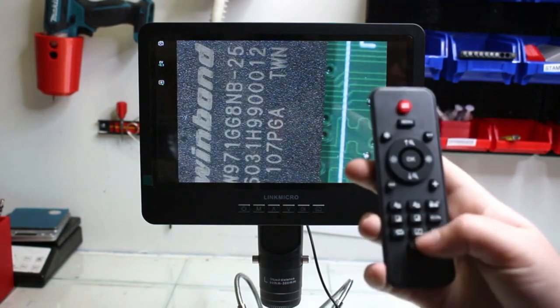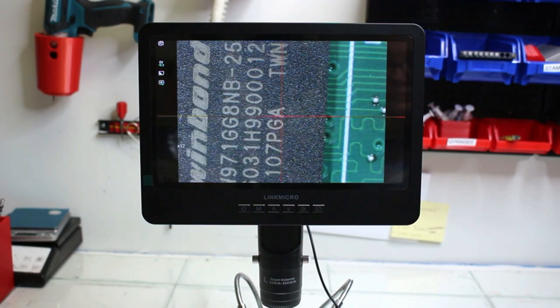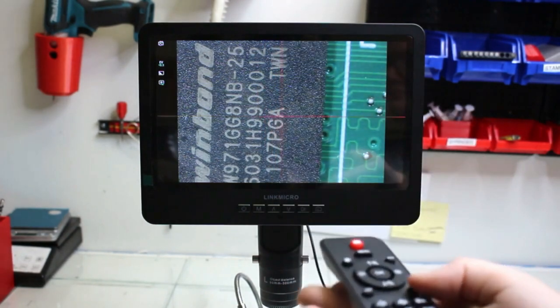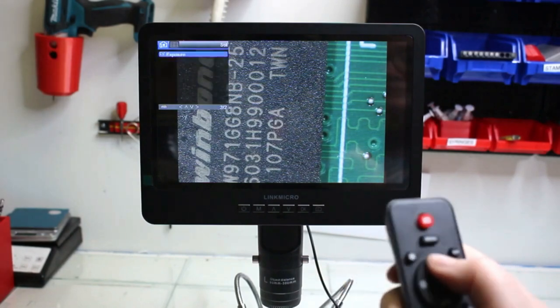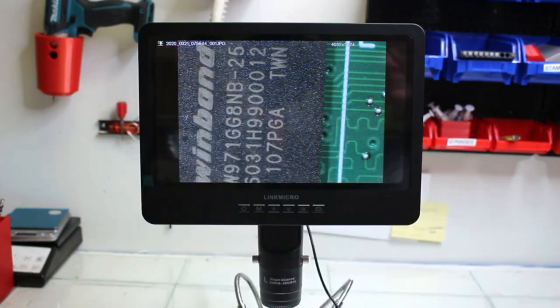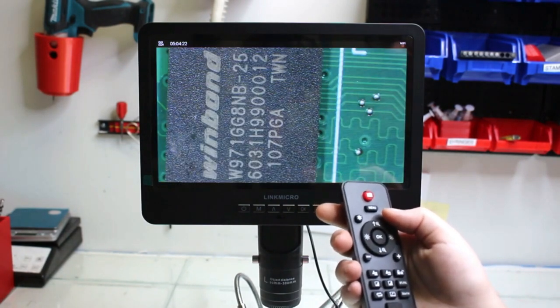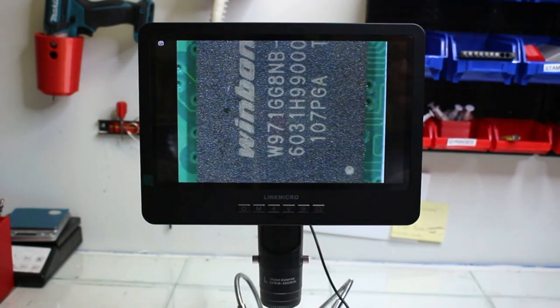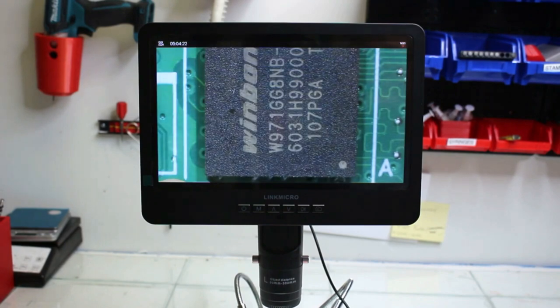That's darkening and brightening the contrast if you need to see something better. They also have an option for a red cross or red X to mark something, using that X button on the right side under the circle. When you press mode it brings up a lot of different options to explore — that's how you'll find a delete area for any photos or videos. In video mode you'll see a video icon, and in picture mode you'll see a picture icon. To know what you've already captured, a photo shows as a girl in a picture, and a video shows as a film strip.